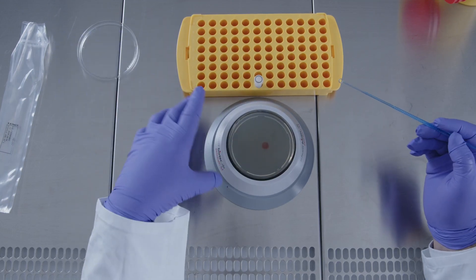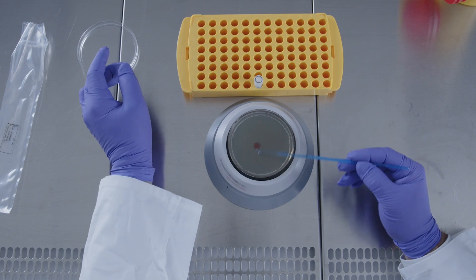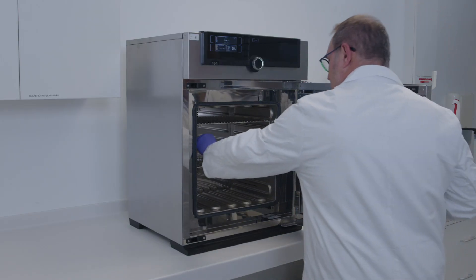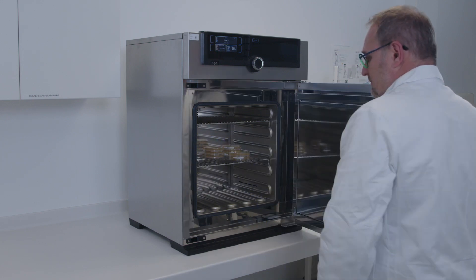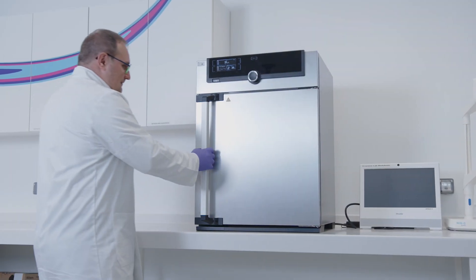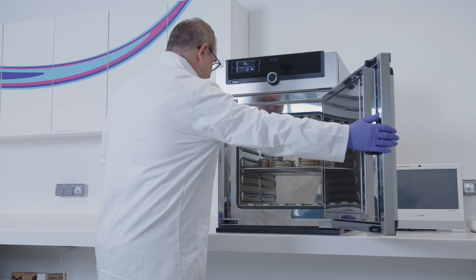Spread the drop over the entire plate. Incubate the plate according to the guideline. Take the plate out of the incubator and count the colonies.